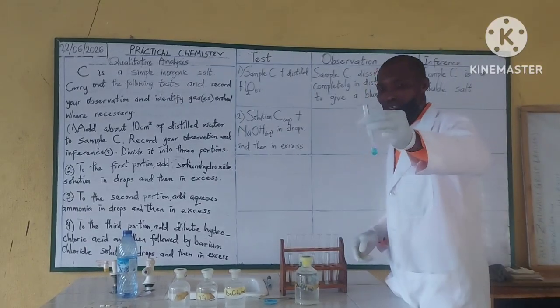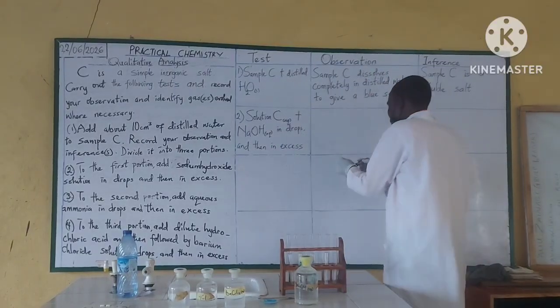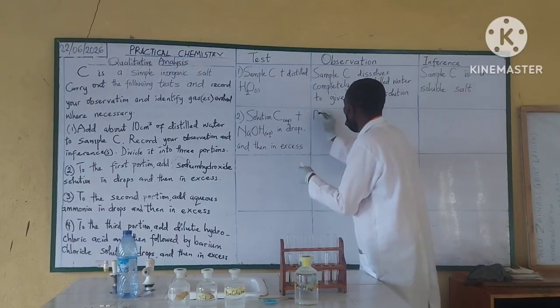If we are looking at it, we record this as blue gelatinous.